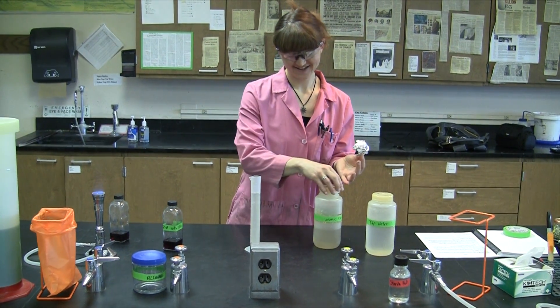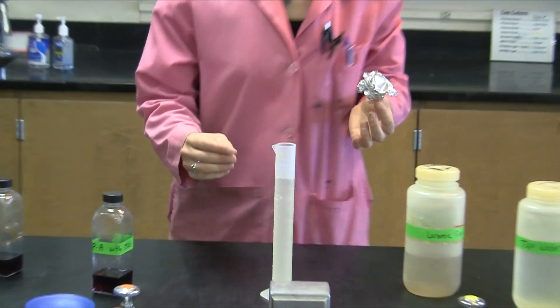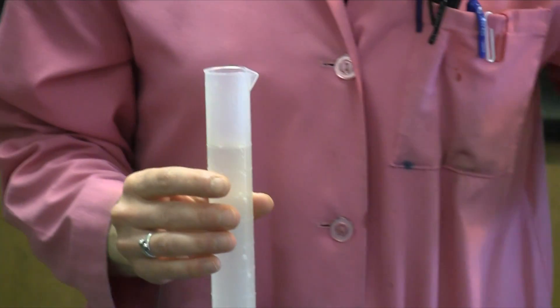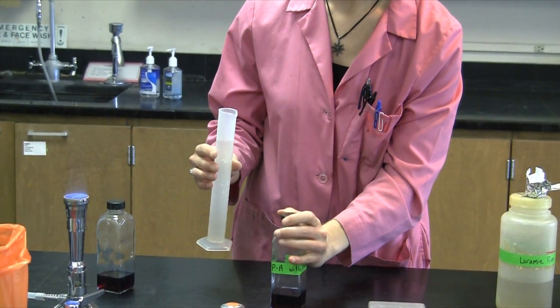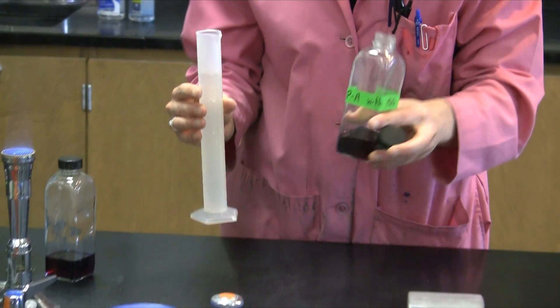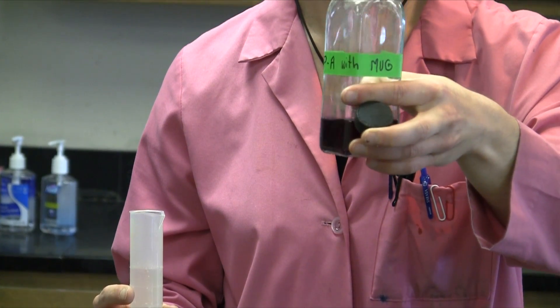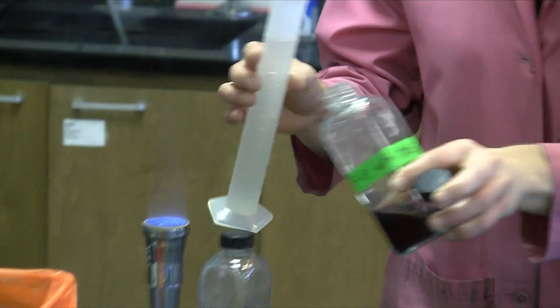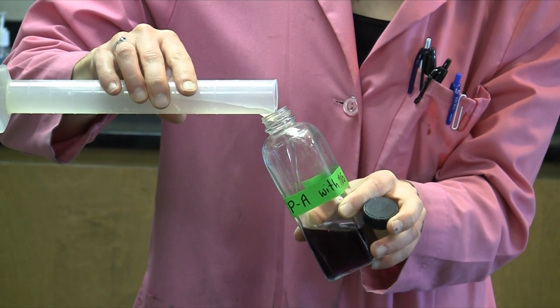Once you've accurately measured 100 milliliters of your water sample, you're going to pour this into the PA broth. Our PA broth in this experiment is a little bit special because we've added MUG to it. Methylumbelliferyl beta-D glucuronide, or MUG, is going to further allow us to look for the presence of fluorescent bacteria, such as E. coli, that are able to convert MUG to a fluorescent compound that we'll be able to see under the UV light.